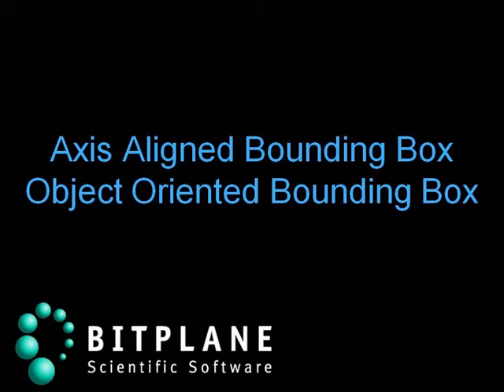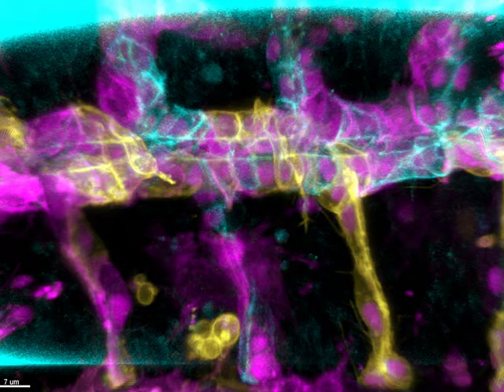This tutorial explains the bounding box statistical variables. These statistical variables will be first shown using the confocal 3D Drosophila embryos image.